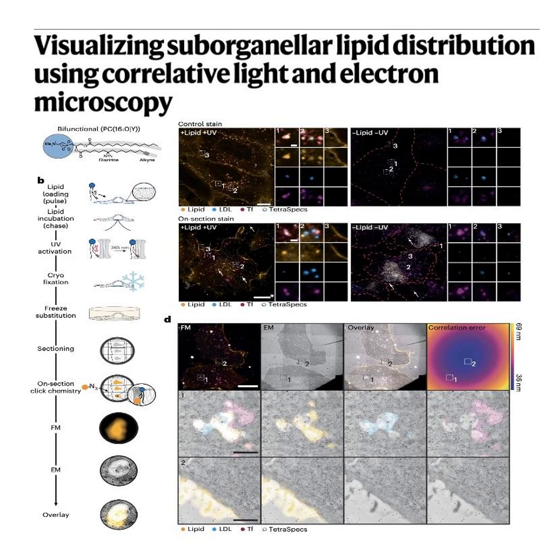That's the one. The mission for today's deep dive is to figure out exactly how scientists built this new camera, basically, to photograph individual lipid species at the ultrastructural level. Yeah, to finally see the roads. Exactly. And by the end of this, you are going to understand how cells actively sort their own physical infrastructure. Yeah. So lipids aren't just passive building blocks holding the cell together. No, they're so much more dynamic than that.